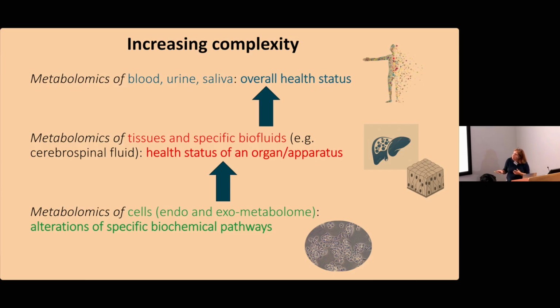Then there is metabolomics of cells. If you look at cell cultures, you can monitor the changes following a given treatment inside cells, and also the exchange of molecules with the growth media. And my talk will be focused on this aspect.